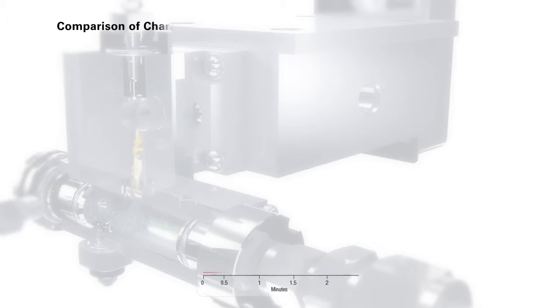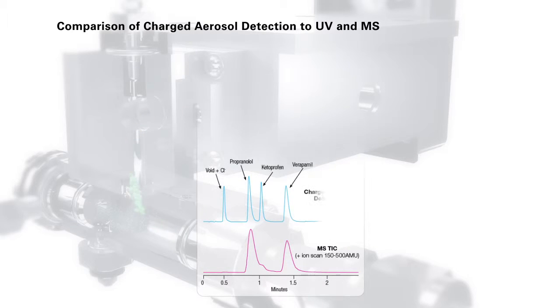This example shows a comparison of charged aerosol detection to UV and MS for the detection of pharmaceuticals. As you can see from these overlaid chromatograms, there are components detected with charged aerosol technology but not by ultraviolet detection or mass spectrometry.